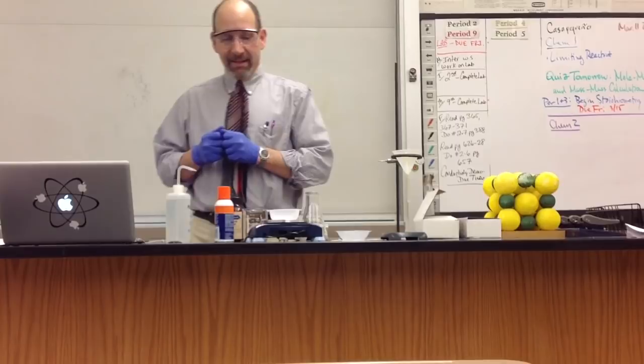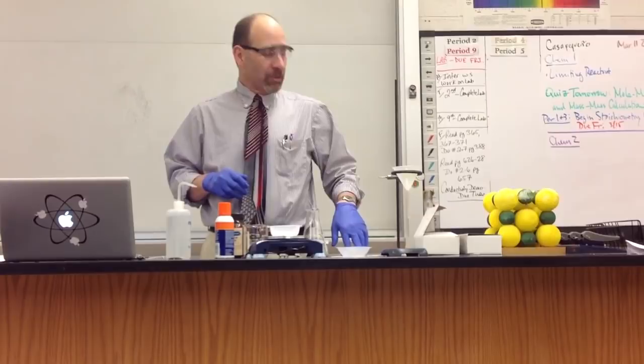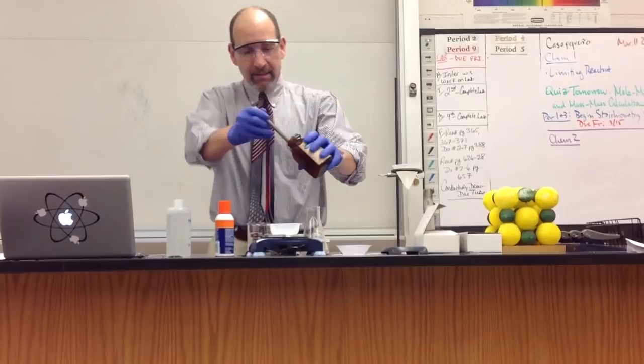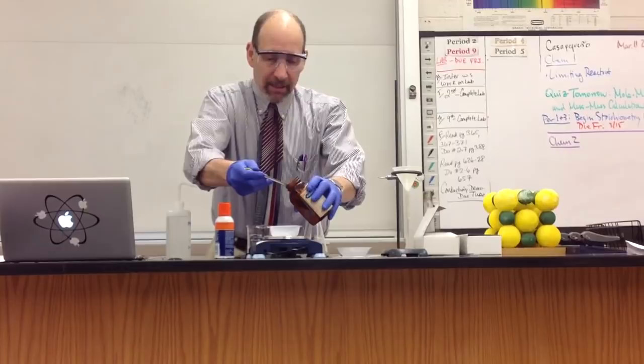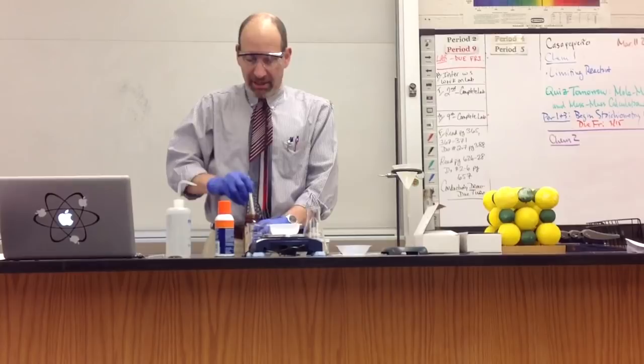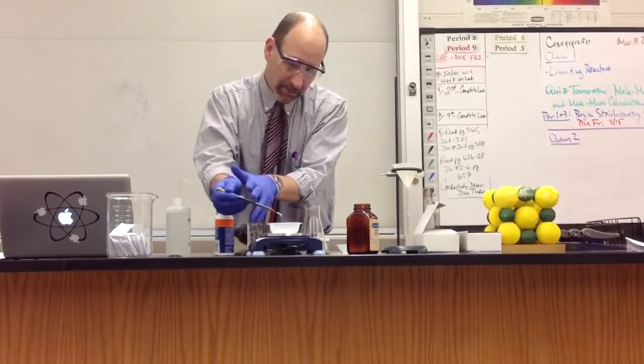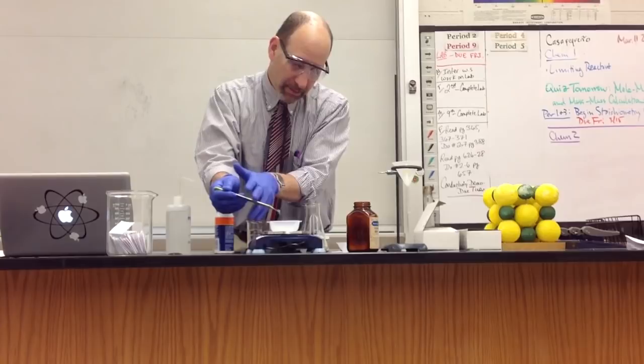At the very beginning, it says I want to measure out between 1.48 and 1.52 grams of NAI. I want to have about 1.50 grams. So I'll measure that out right now. Now, what's going to happen is you're not going to use my data. I'm just going to give an approximation here. I have a whole bunch of data slips right here that everybody is going to take from. All right, perfect. 1.50 grams.